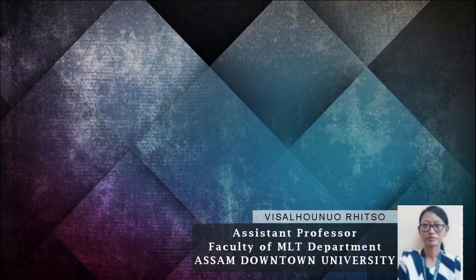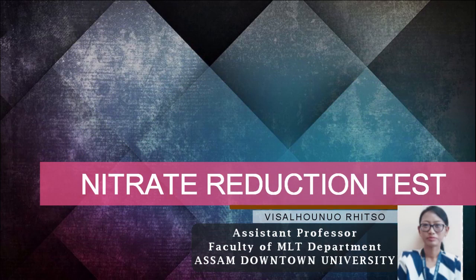In this video, I'll be explaining the nitrate reduction test. The nitrate reduction test determines the production of an enzyme called nitrate reductase, which results in the reduction of nitrate to nitrite.